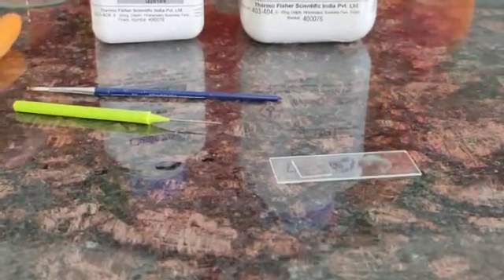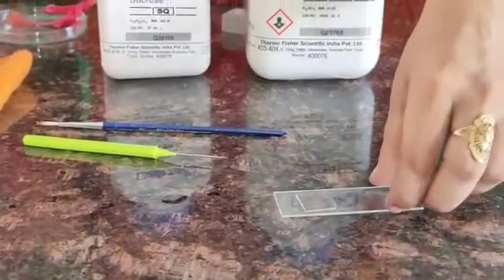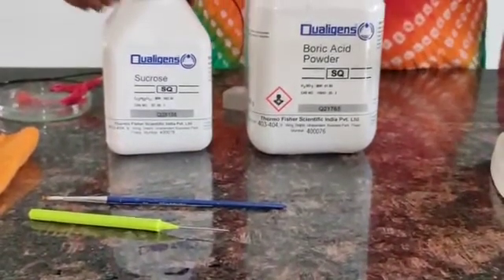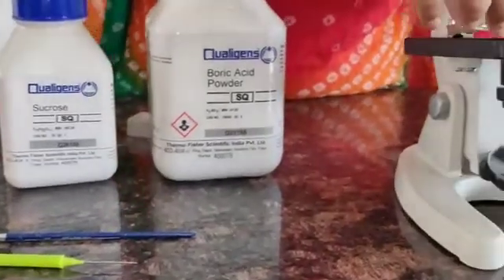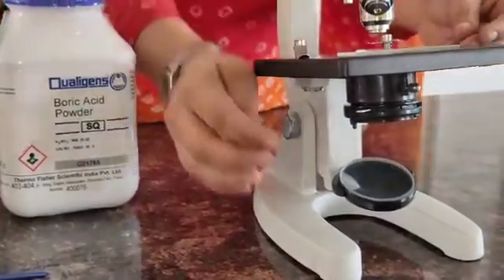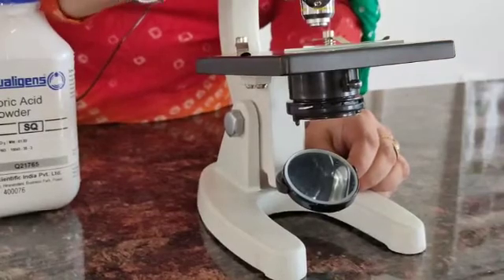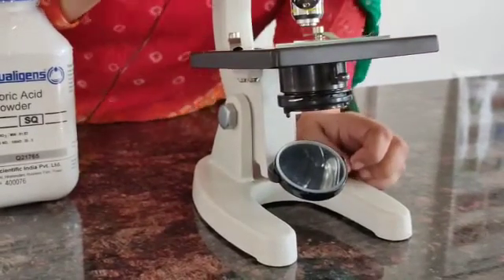Now this slide we will leave for at least 15 to 20 minutes so that the germination process can take place. I have already prepared one slide, which I will keep under the microscope. First I will adjust the microscope and keep my slide on the stage, fix it with the help of the clip, and then observe it.